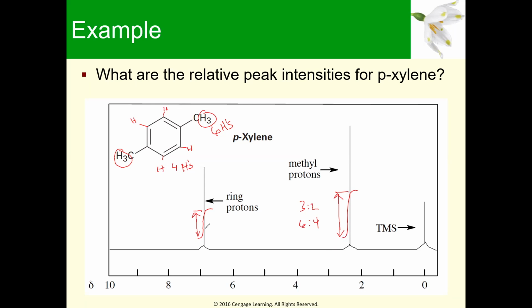In the previous slide, if you don't mind, I'll draw this the way it was in the previous slide so you can see the difference. So it just had the curve, and then it just kept the line going, and then just started the curve and went from there. But you'll see it both ways in NMR spectra. Sometimes, they'll kind of split out this middle part of the line and then drop it down like they did here. You see it both ways.